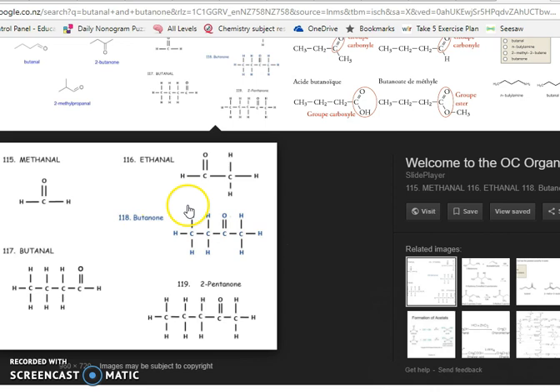In the butanone, you have 2 carbons that are adjacent to the carbonyl group, and 1 carbon that is further away. Now that will have an impact because the carbons that are immediately adjacent to the carbonyl group tend to shift somewhat further downfield. The further away you get from the carbonyl group, the closer those CH2 and CH3 peaks get back to the original.